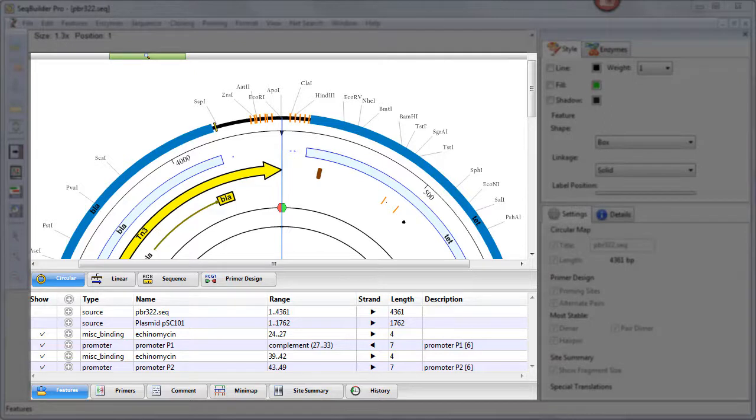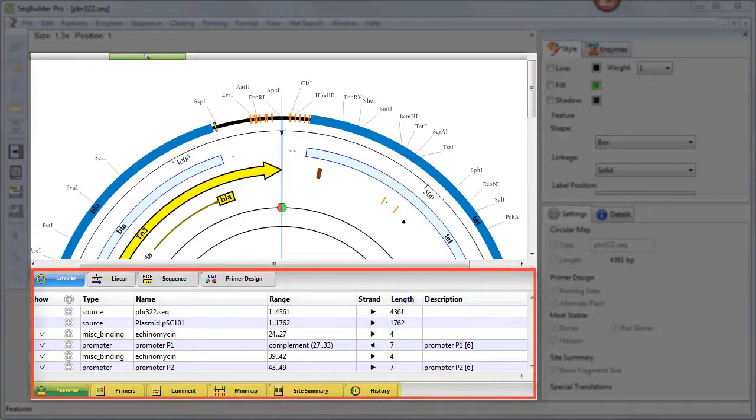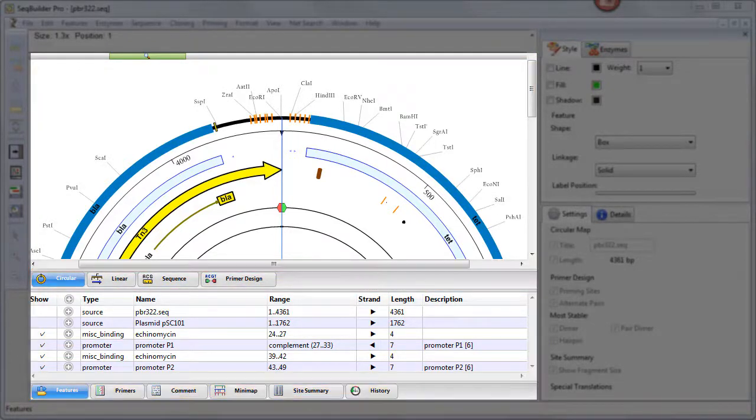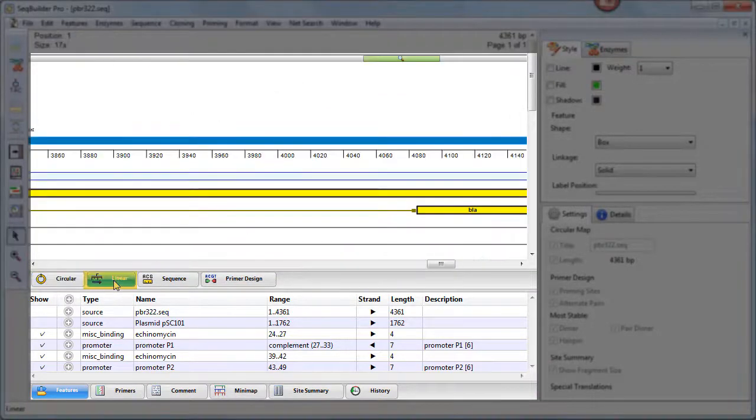For instance, a nucleotide sequence lets you choose from four different views in the upper pane and six in the lower pane. To change to another view, simply click on the tab with the name of that view.